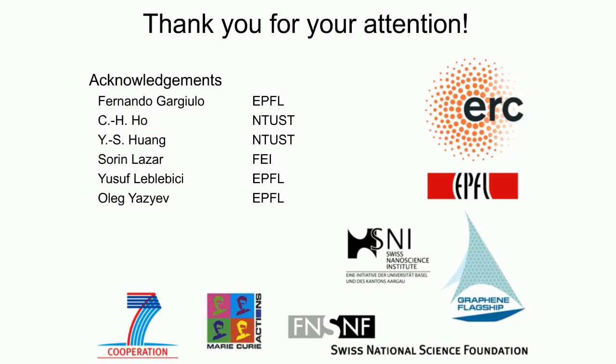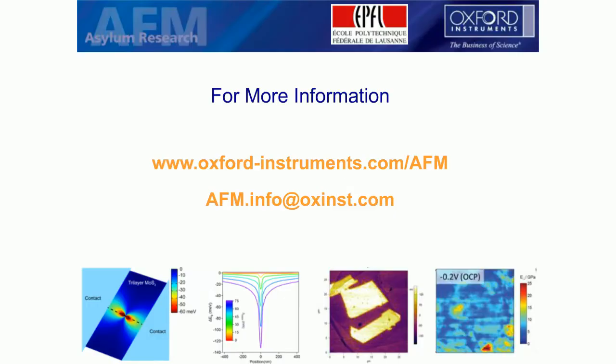Okay. So on very, very flat samples, the tip radius is not as important as you would think it is, because there's always one piece of that tip that sticks down farther than anything else. Where you run into problems is if you have a very rough sample. If you have a very rough sample, you have to get as sharp a tip as possible. I know IBM used to make these FIB tips. I think they still do. And Nanosensors has these SSS tips, I think, that are super sharp. And Olympus has some as well. So, yeah, if your sample is rough, it's extremely important. If your sample is smooth and flat, like a lot of these 2D materials, then you can often get around that.